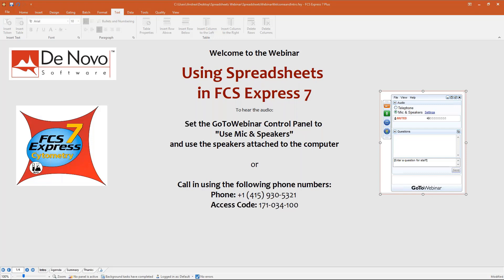FCS Express 7 allows you to use the spreadsheets feature to access most of the functionalities of a Microsoft Excel-like spreadsheet directly in FCS Express, with the advantage of a direct link into your data, statistics, gates, and tokens. The idea is that the spreadsheet provides an integrated Excel with live updating capability, keeping the special needs of cytometrists in mind.